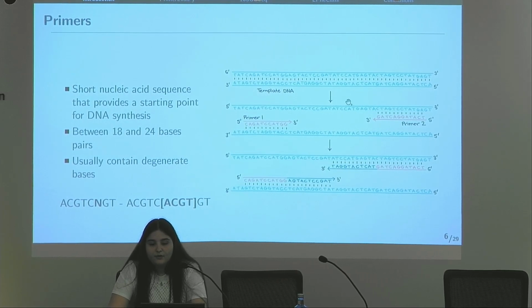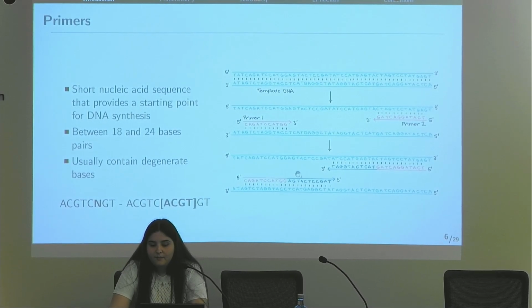Here we have an example of DNA amplification using 2 primers. One forward primer that matches the sequence in one conserved region, and a reverse primer that matches another conserved region. With them, we can amplify the fragment in between that corresponds to a variable region that we can use to differentiate these microorganisms.